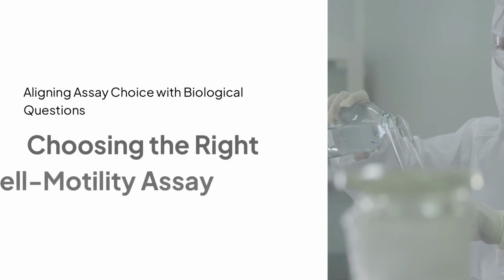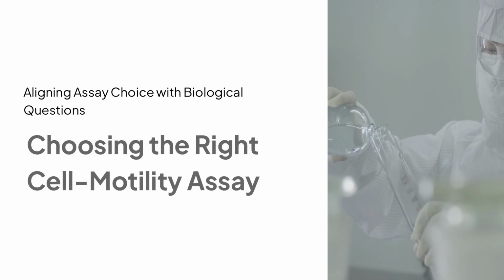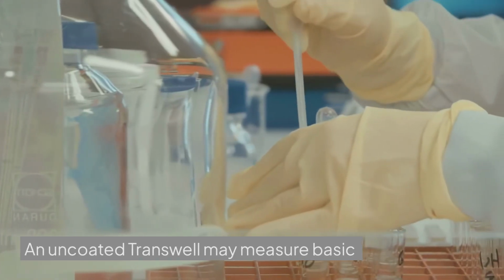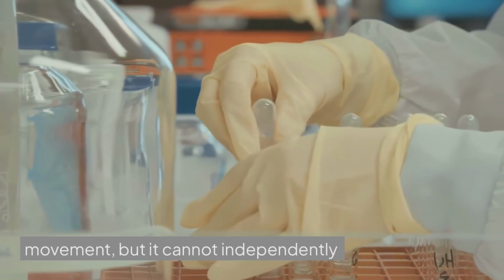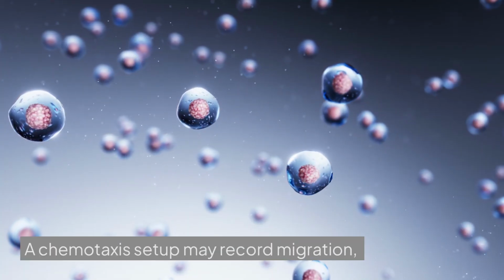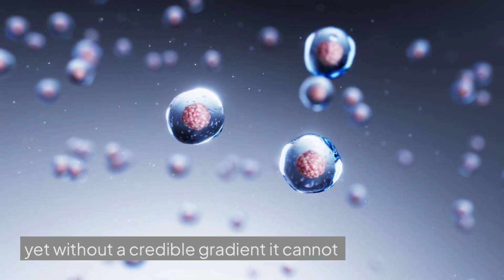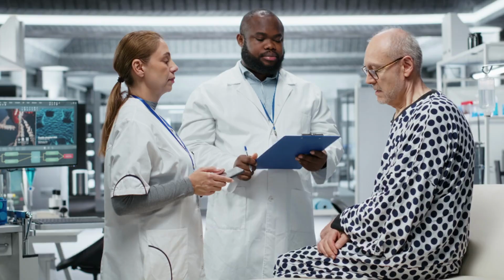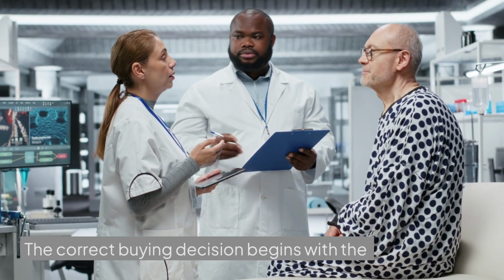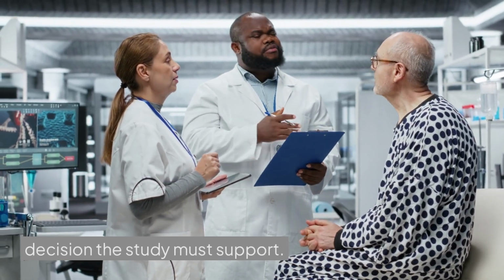Choosing the wrong cell motility assay can produce clean data that answer the wrong biological question. An uncoated Transwell may measure basic movement, but it cannot independently demonstrate barrier traversal. A chemotaxis setup may record migration, yet without a credible gradient it cannot establish directionality. The correct buying decision begins with the disease mechanism and the program decision the study must support.